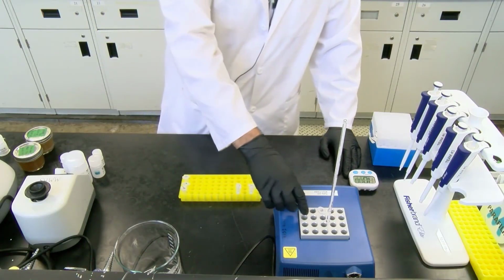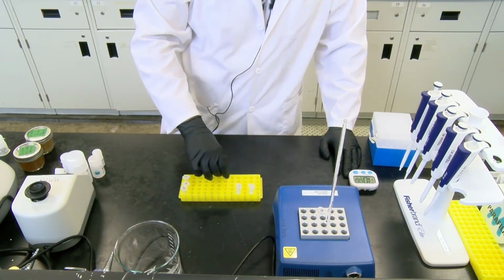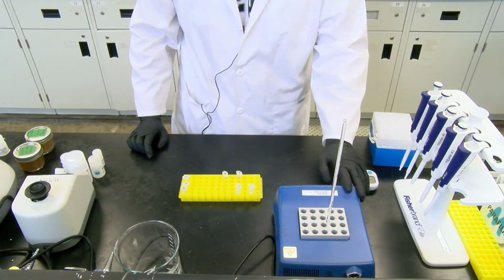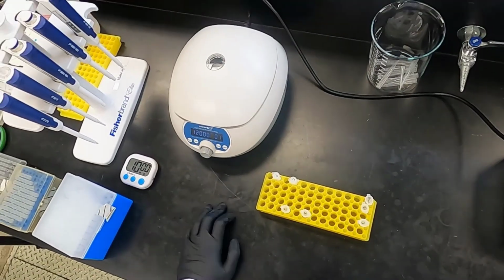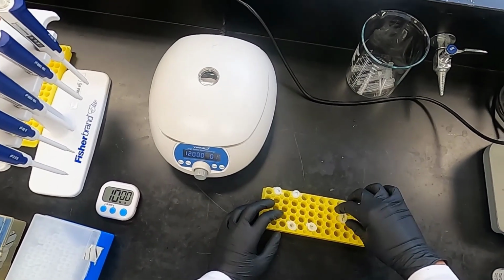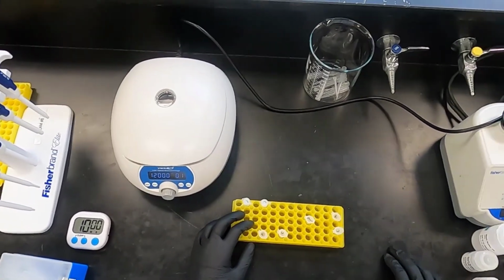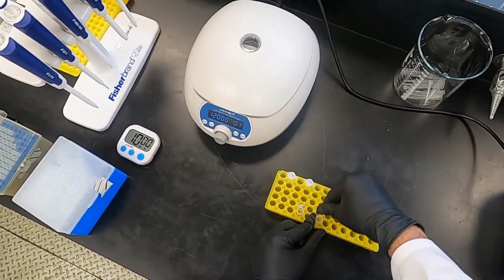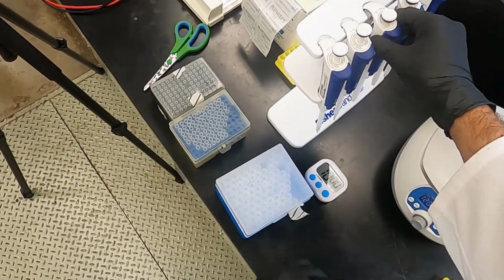So now that the timer has expired, we're going to remove our samples from the heat. And in the meantime, we're going to swap this out for a mini centrifuge. Alright, now that we've swapped it out, before we put it into the microcentrifuge, we're going to add 220 microliters of ethanol into each. We're going to do that before we start our whole centrifugation process.